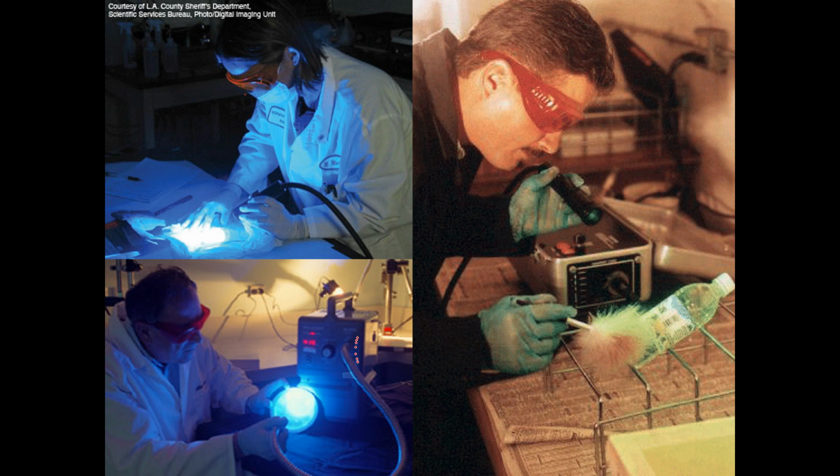This is another laser power supply. It looks like it's in the blue. And then I've got one of these. It's not a laser, but these LEDs are getting brighter and brighter. I bought this for $35 at Amazon. These crime lights used to be over $100 each. It does put out 365 nanometer light, which is in the UV.